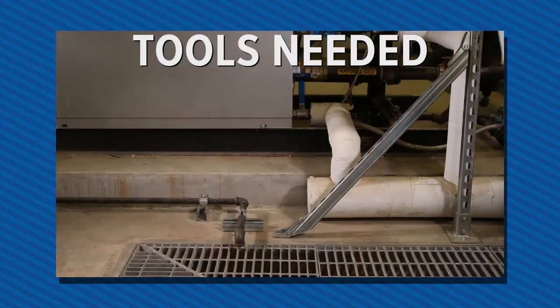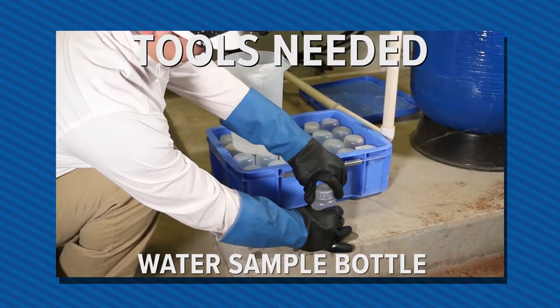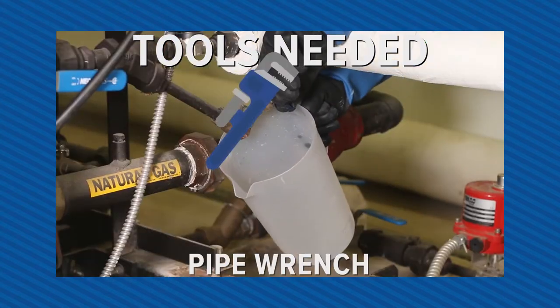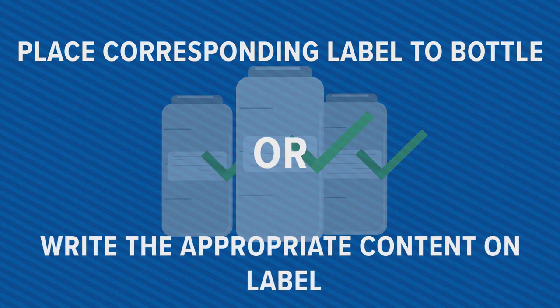The following tools will be used for this sample: a bucket or pitcher, water sample bottles, and possibly a wrench. To avoid the mix-up of your samples, use appropriate labeling — either place the corresponding label on the sample bottle or write the appropriate content information on the label.